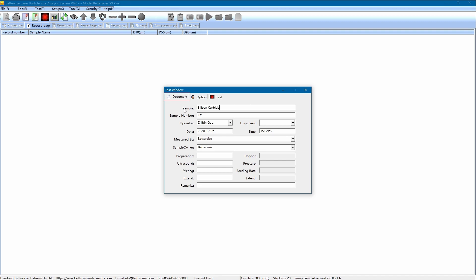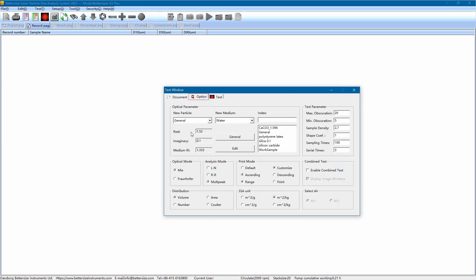After the input is completed, click on the option tab. There are many parameters to be entered, and note these parameters must be set correctly, because they directly affect the accuracy of the results.